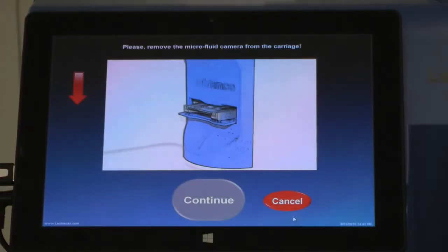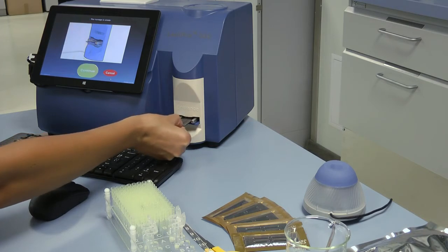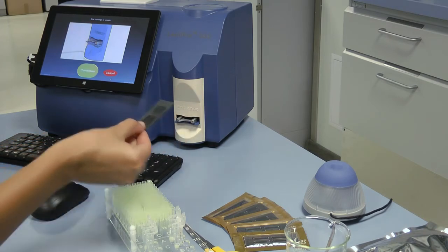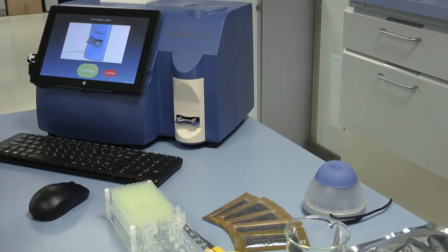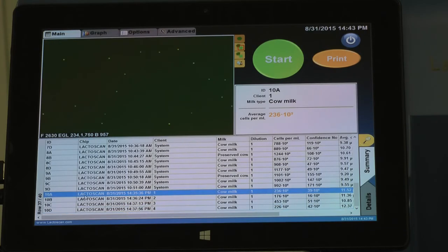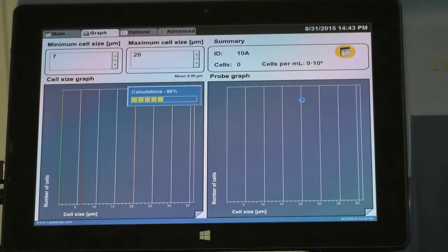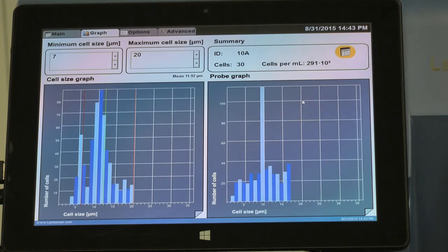A message is shown to remove the microfluidic camera from the carriage. Take the LactoChip out. To proceed back to the main screen, press Continue. Choose Display Graph from the screen options in order to see the test results on a graphical image.